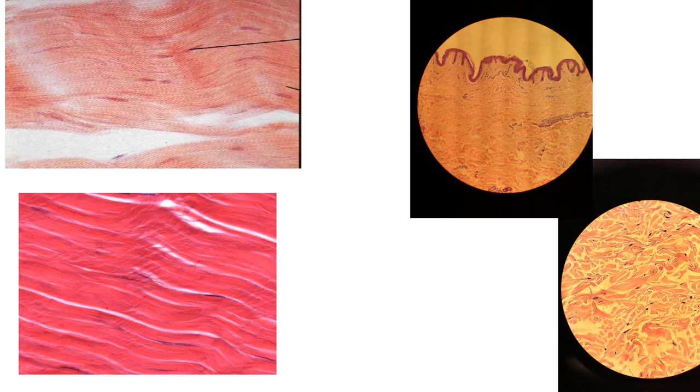So this is dense regular connective tissue, and so parallel collagen fibers. And you remember collagen fibers are strong, so we find this tissue in structures that need a lot of strength, so tendons and ligaments are the key places.